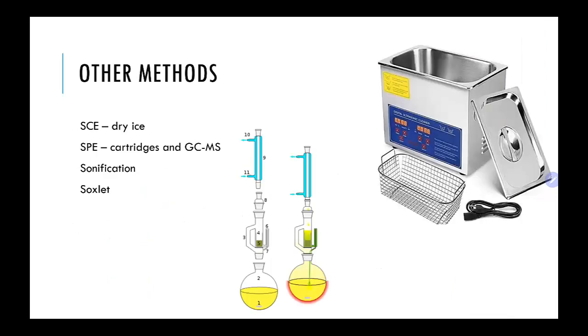Some of you might be choosing a project which is basically this lab, but you're going to be using sonication. It's a little water bath, but it uses sound waves, and those sound waves generate bubbles, and because it's generating these bubbles, it also generates heat. We'll put our samples in little vials, and for your project you're going to compare it to this experiment to see if it's any better. So sonication is another way of obtaining material.